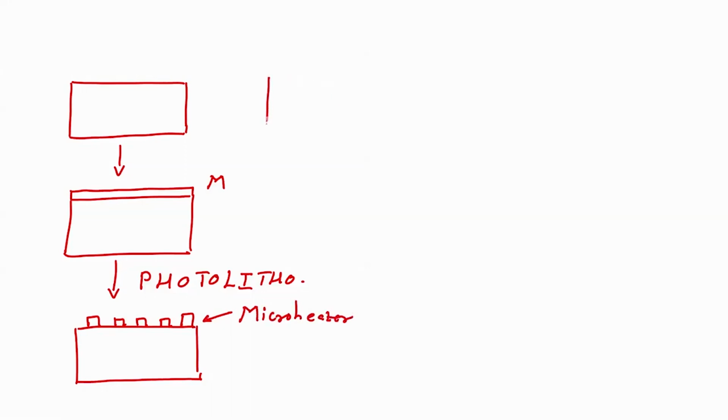The next step would be to deposit silicon dioxide on the micro heater.